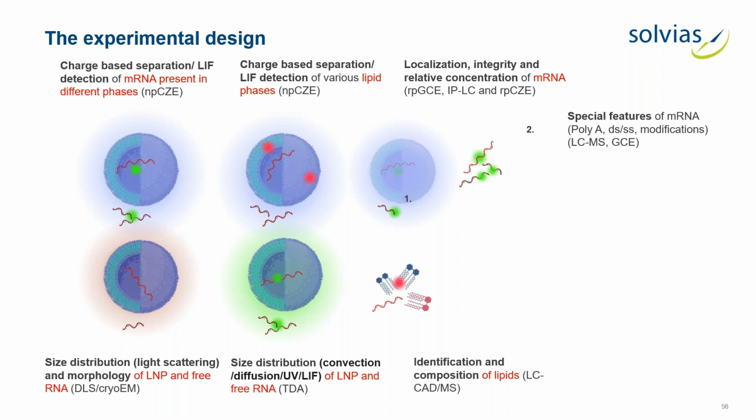If I do the same procedure with lipid-specific labeling reagents, I get the information regarding the ionic mobility profile of all lipid-containing but also micellar phases with this technique.